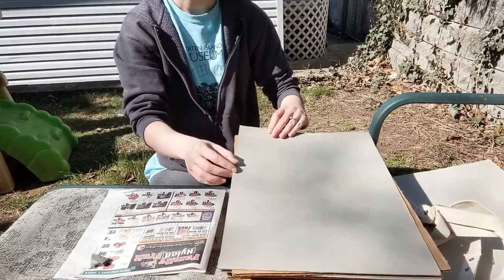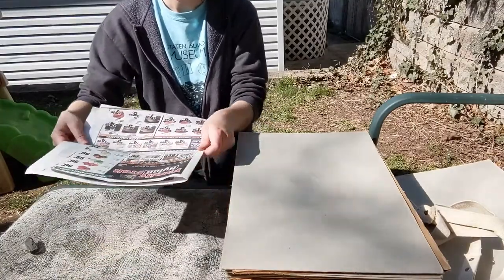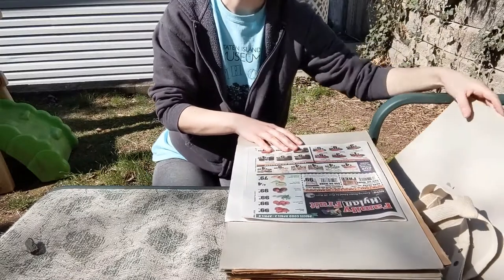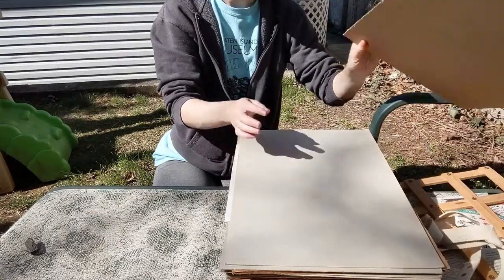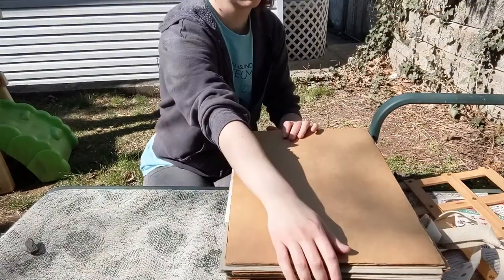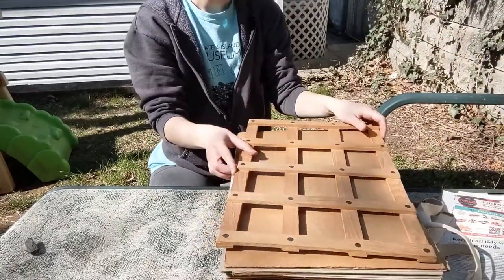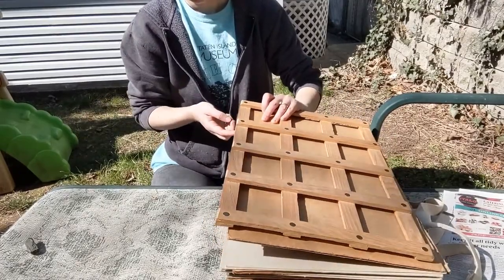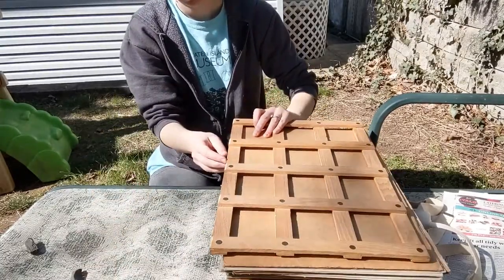You want to sandwich it: a piece of cardboard, a piece of blotting paper, your newspaper with the plant, another piece of blotting paper, followed by another piece of cardboard. Those will all get nicely stacked up and into the press. If you're using books, you do the same sandwiching method — cardboard, blotting paper, plant, blotting paper, cardboard — and stack some books over top. Don't forget your label.